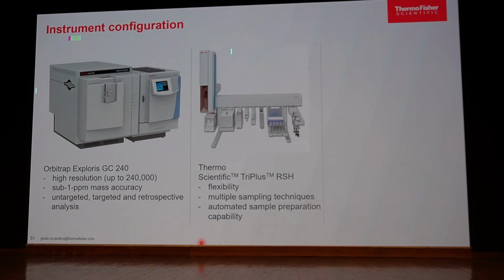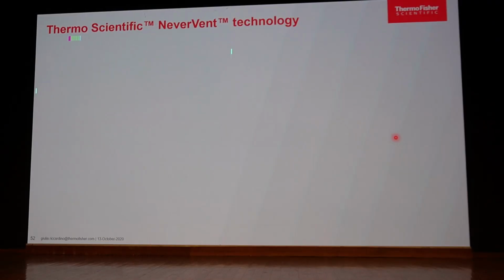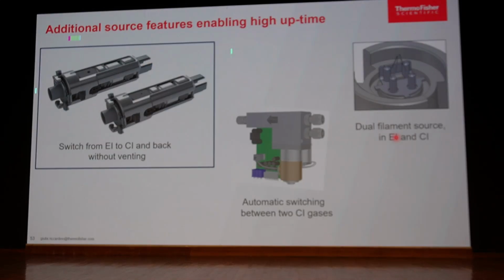So this is the instrument configuration, the SPME Arrow, and these are the tools used with the SPME Arrow. So we can utilize those. Sunil has already explained these, so I am not going to repeat.